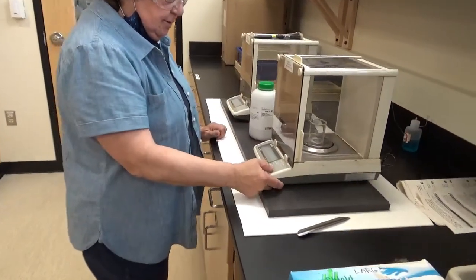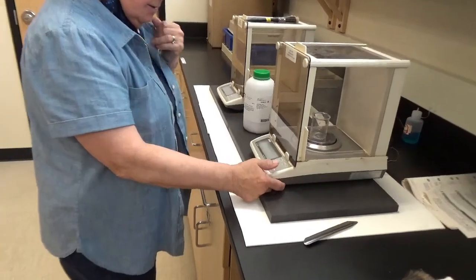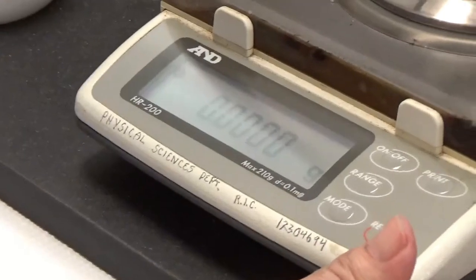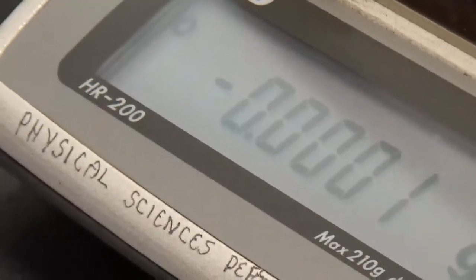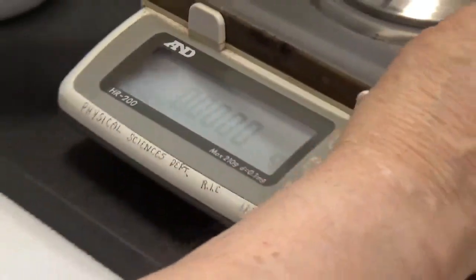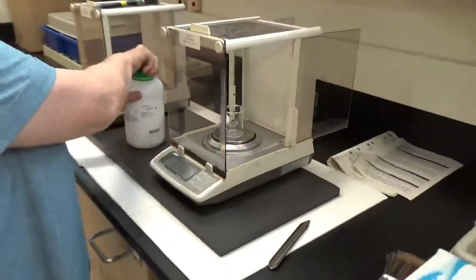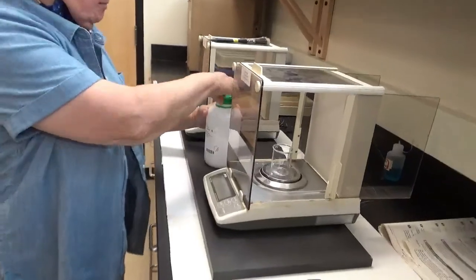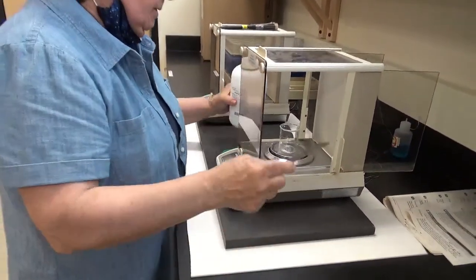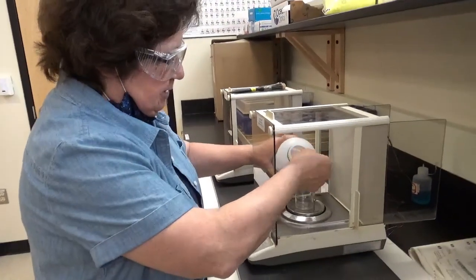So I'll re-zero it. Okay, and I'm going to put between 4 and 6 grams. Doesn't matter what it is as long as I know what it is exactly. So try not to spill.